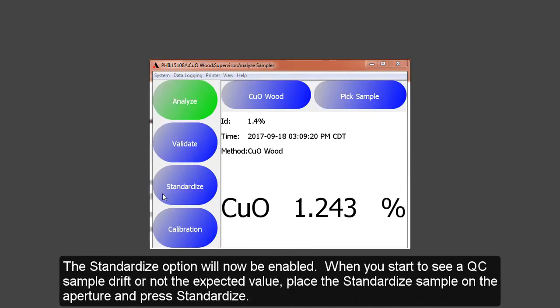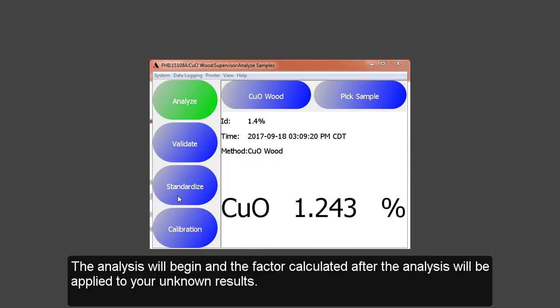If the Adjust Standardized is light blue, it is enabled and set up. If it is dark blue, the method does not have this option set up. When you start to see a QC sample drift or not the expected value, place the standardized sample on the aperture and press Standardize. The analysis will begin and the factor calculated after the analysis will be applied to your unknown results.